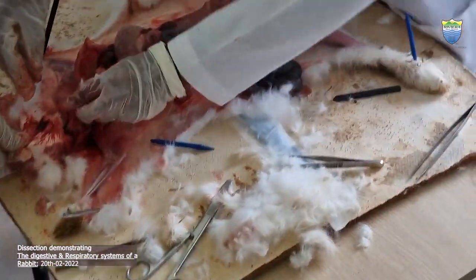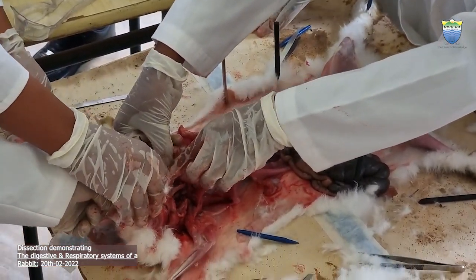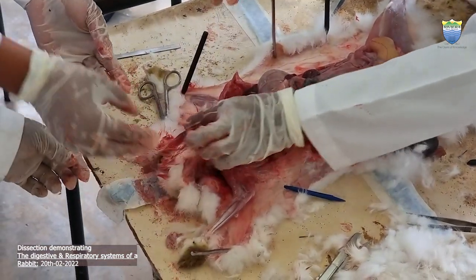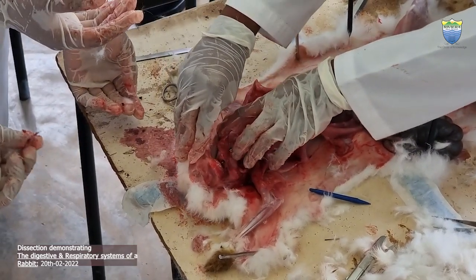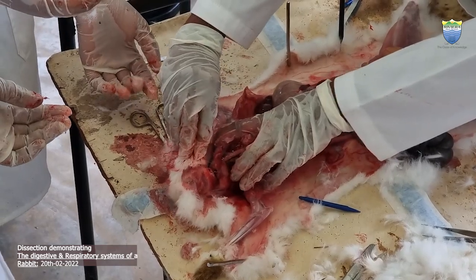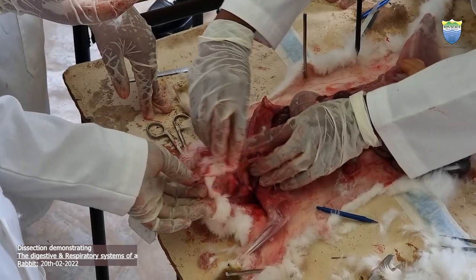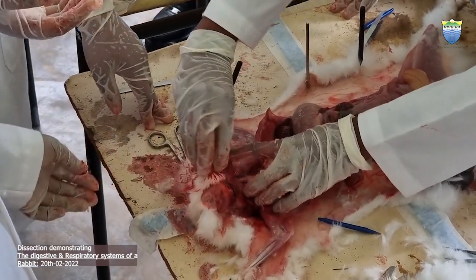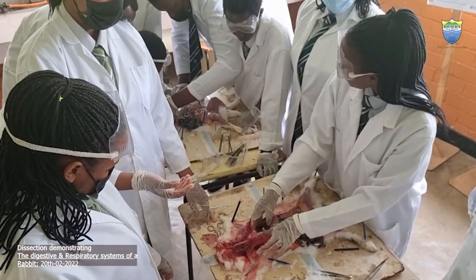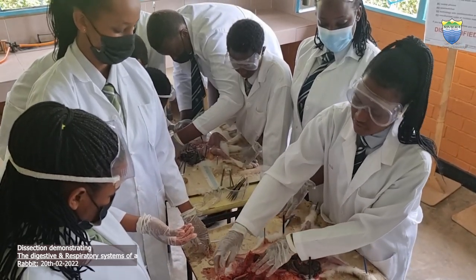Inside here, if it is open enough, there is a tongue. It's really long. When a rabbit eats food, it's a rodent, so it's mostly on vegetables like cassava leaves. The mechanical digestion starts in the mouth due to the teeth. Then it flows into the gullet and enters the stomach. Then it goes into the small intestines and the whole digestive system.